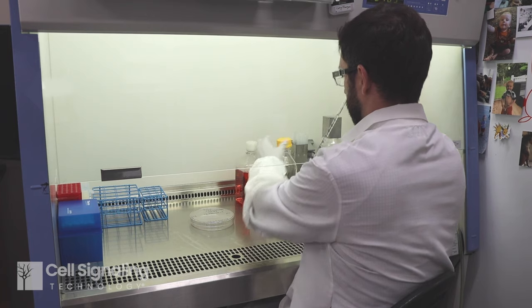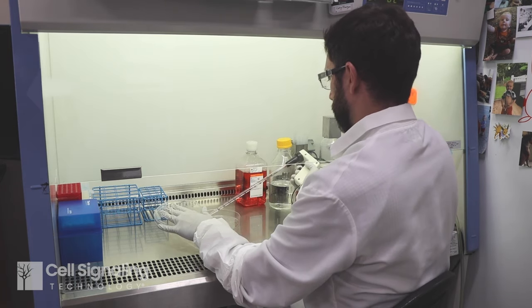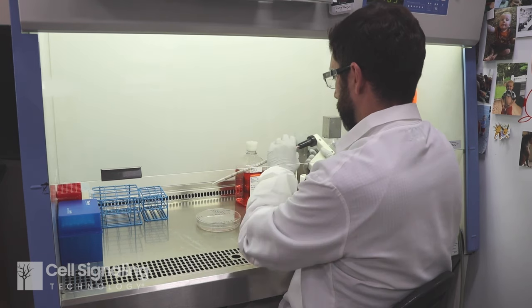Good sterile technique will help your experiments run smoothly and generate reproducible data. Because microorganisms are in the air and on surfaces in the lab, cell culture tasks must be done in a sterile environment to prevent contamination.